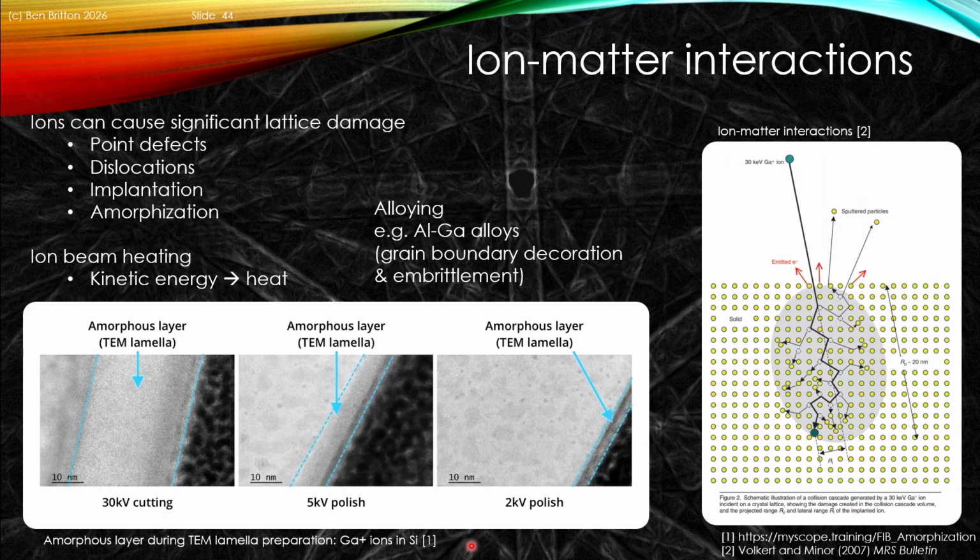So we see why this matters, because the incident ion can create a series of defects as it's going into our material. We can see that we can effectively get displacement of primary atoms or ions in the lattice. They can get knocked to secondary sites, and we can effectively form self-interstitials. We can also get those effectively sputtered and ejected out of our material.